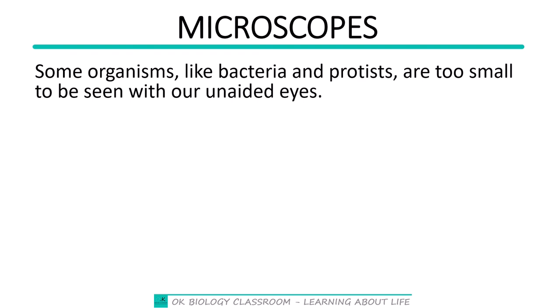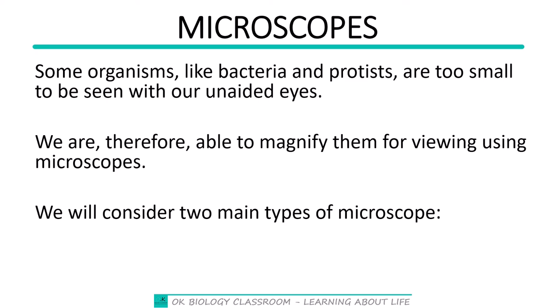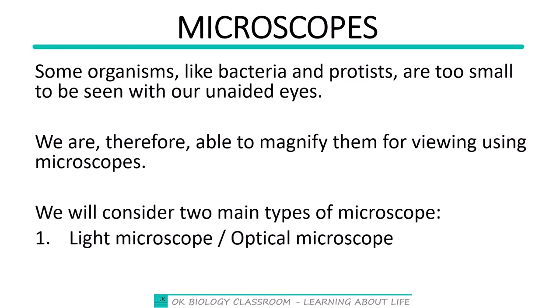Yes, microscope became very important too in biology because it was realized that there are some organisms that are too small and couldn't be seen with the unaided eyes, and so there was a need for something to magnify these organisms for observation, and that is what brought about the microscope as a tool to help us to magnify these small organisms for further studies about them. And I'm quite sure that as a student you have seen microscope somewhere, maybe in the school lab or in the hospital, right? There are so many types of microscopes, but we are going to consider these two main types.